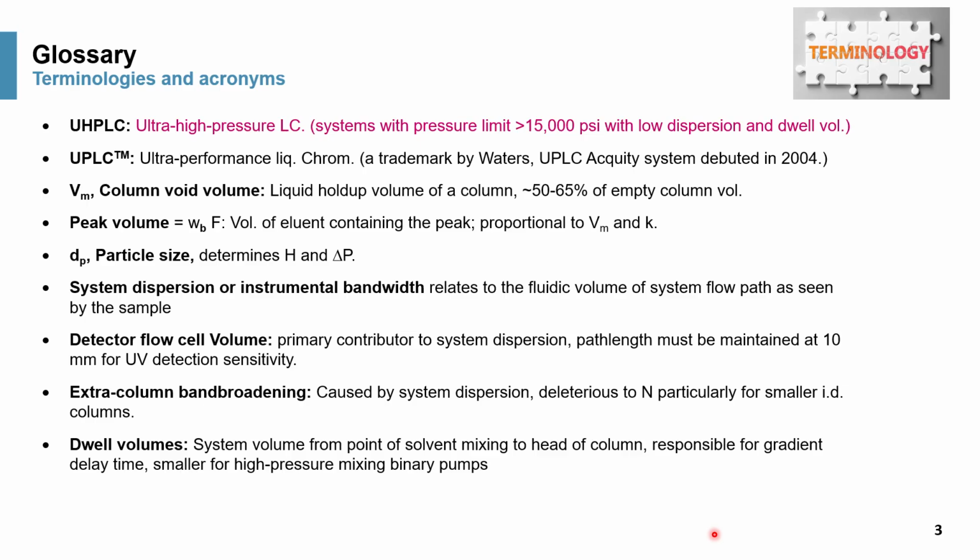Here is some terminology and acronyms for UHPLC. Number 1, UHPLC stands for ultra high pressure LC, typically describing systems with pressure limits above 15,000 psi. Also, the system comes with low dispersion or low instrumental bandwidth and also lower dwell volume.